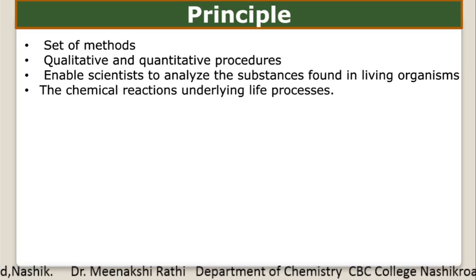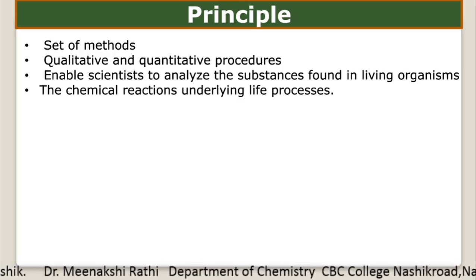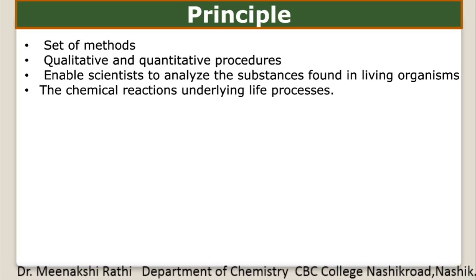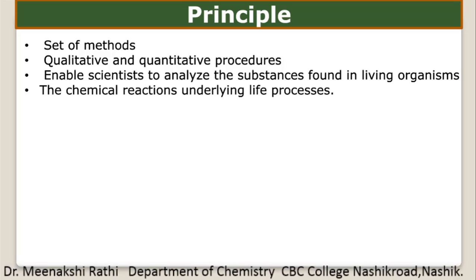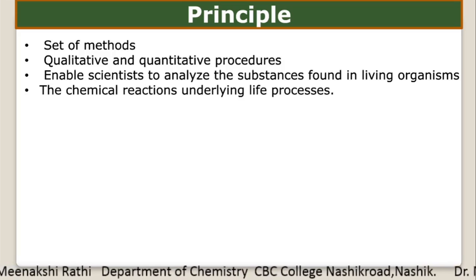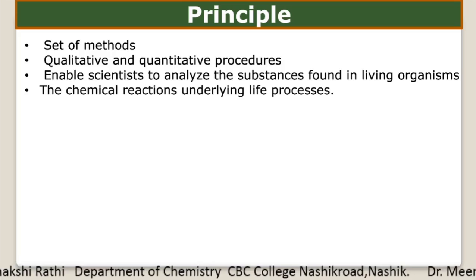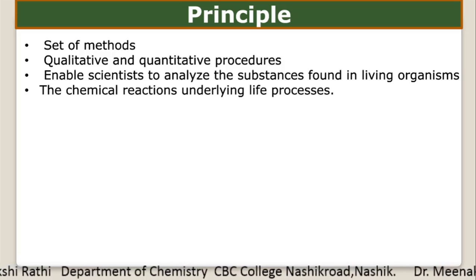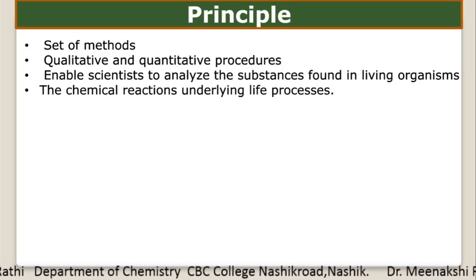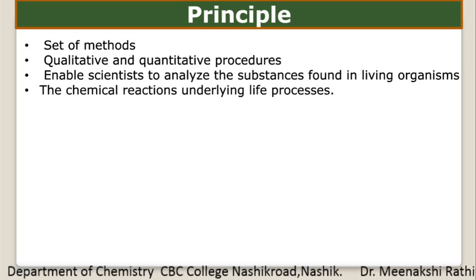Now the methods available for purification of biomolecules range from simple precipitation, centrifugation and gel electrophoresis to very sophisticated standard methods like chromatographic and affinity technology, which are constantly undergoing development and improvement.